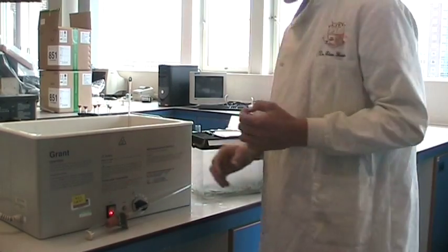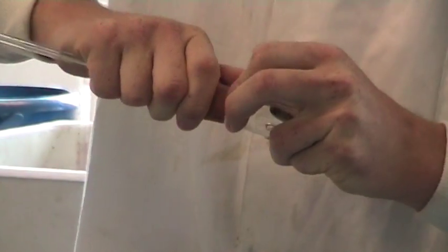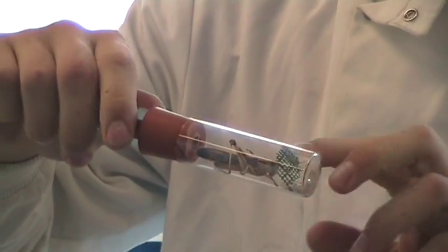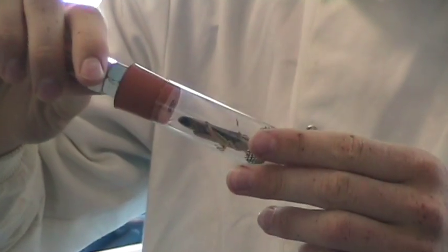And then seal it so it's airtight. The white stuff in the bottom of the tube is soda lime. It absorbs any CO2 that the locust produces when it's respiring.